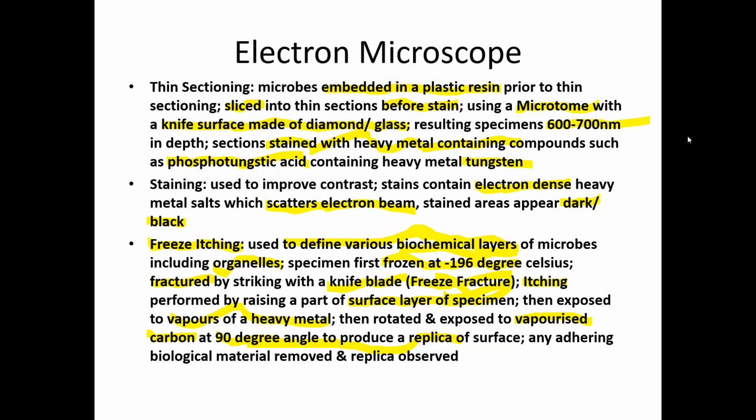And finally, the last portion of the presentation is about the two types of electron microscope. First one is the transmission electron microscope and the second type is the scanning electron microscope. Fine. So first of all, we are going to the transmission electron microscope. Before going to it, if anybody has any doubt, yes, sir.